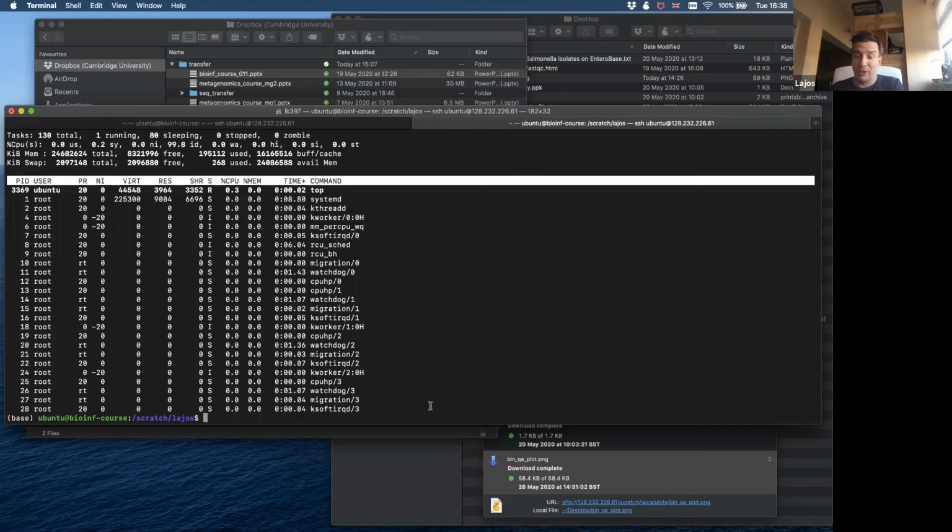If you are not interested in those genes because you just want to see the difference of your new sequencings, of your new isolates compared to your reference, then it's okay to do realignment. And we will do this next time. And you can extract a lot of information from this, but you are also missing information. And this is very important to know.